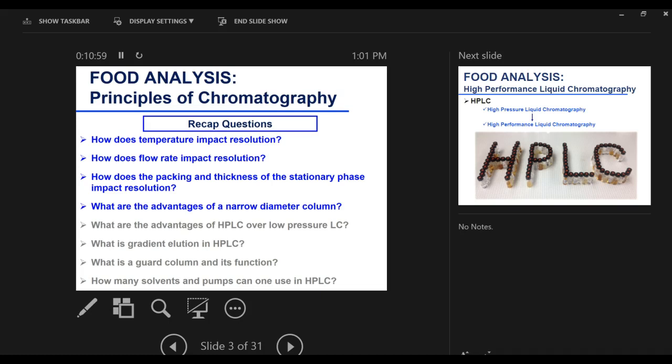With smaller concentration, you have less absorption. But when the peak or the band is narrow, you have the highest concentration, then you have higher absorption. So the analyte is more concentrated in one tiny narrow band. So you can see higher absorption, and you enhance sensitivity that way.